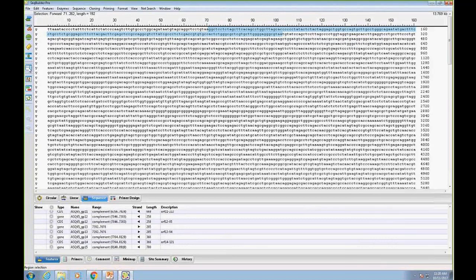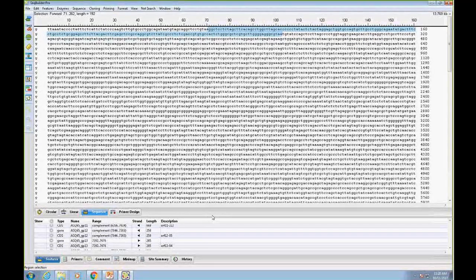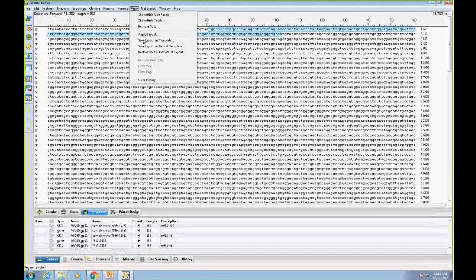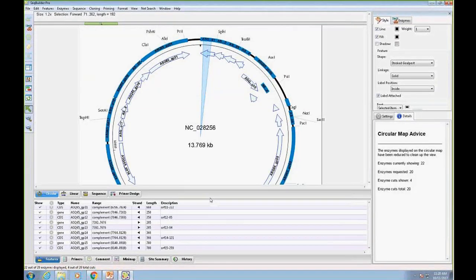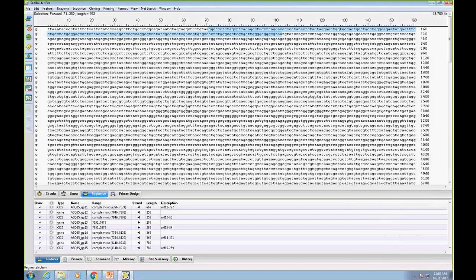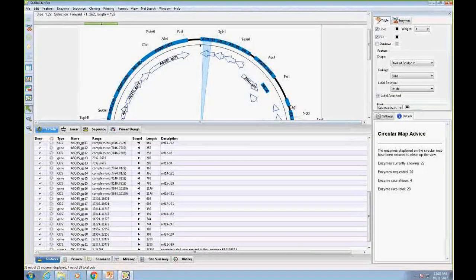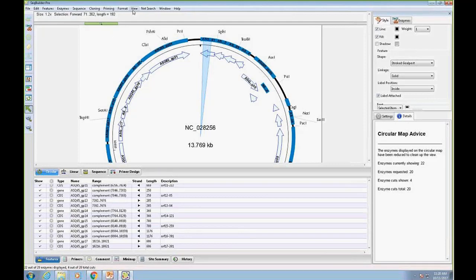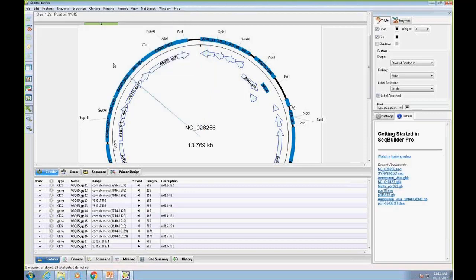For users who prefer the simpler edit-seek style, you can quickly turn off all the extras — ORFs, enzymes, rulers, features, and translations — to get a view that shows as much sequence data as possible in a single window. There's a 'compact edit-seek layout' button for one-click access to this simpler view, and a button to return to the default layout. You can also save your own user-defined default layout.